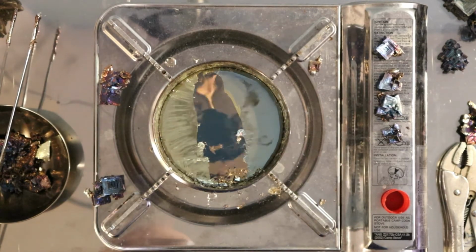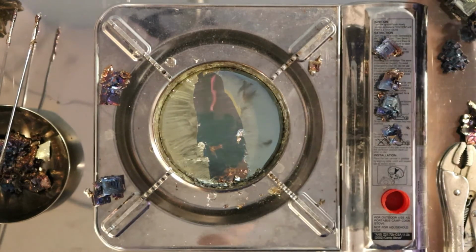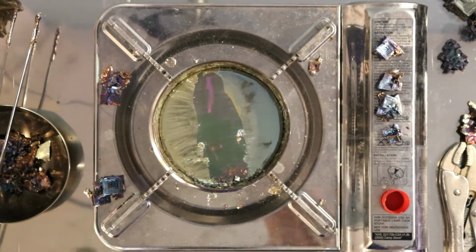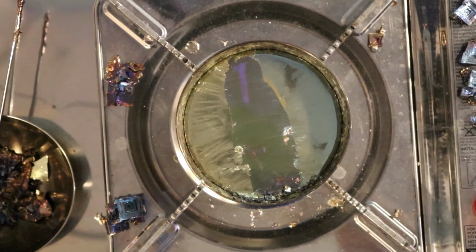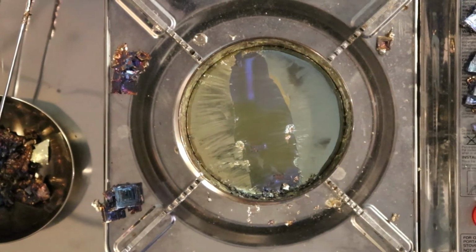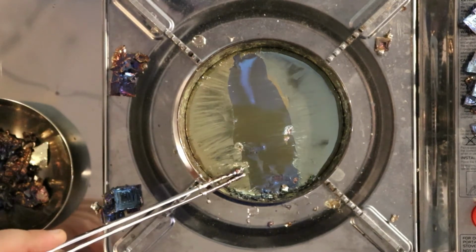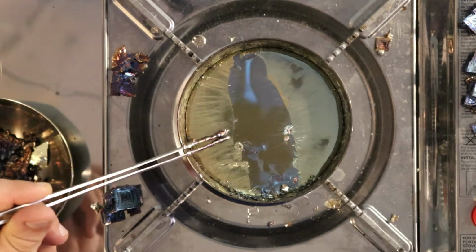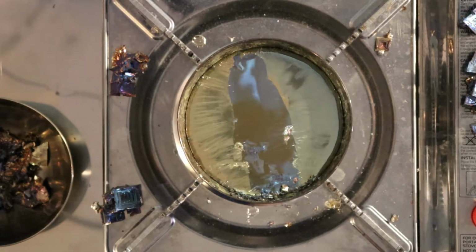Okay, so this looks like a situation where, in the wake of skimming with the spoon, we started forming some crystals right away. Maybe I'll just zoom right back in and hope that focus behaves. Sorry for the wiggles there. You should be able to see right around here these sort of feathery shapes of the tops of these crystals are floating off or growing along the top of the melt.